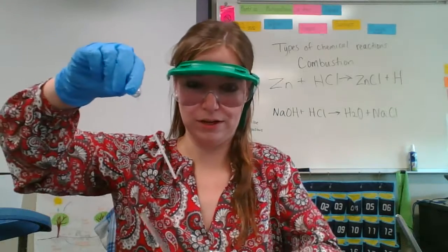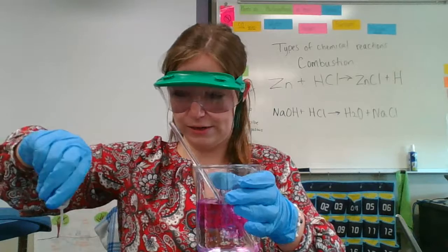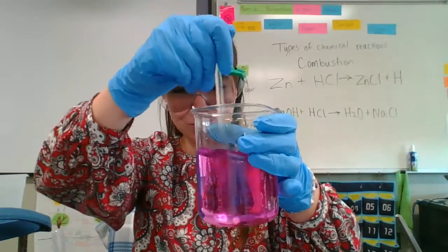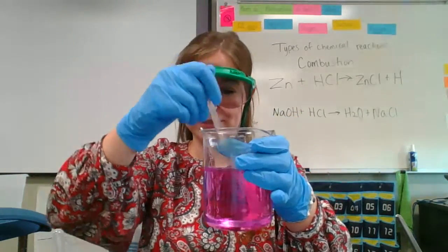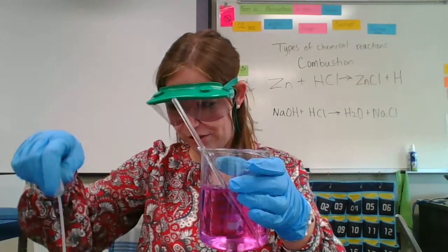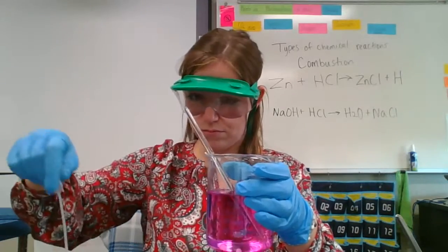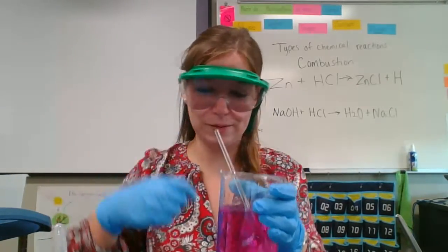Okay, so we're going to put a couple drops in this. Doesn't take a whole lot. Okay, and you should see, this one's pretty cool. I like this one a lot. So sodium hydroxide mixed with water. I added a few things to let you see the color that is happening right here. So it is very pink, very purple.